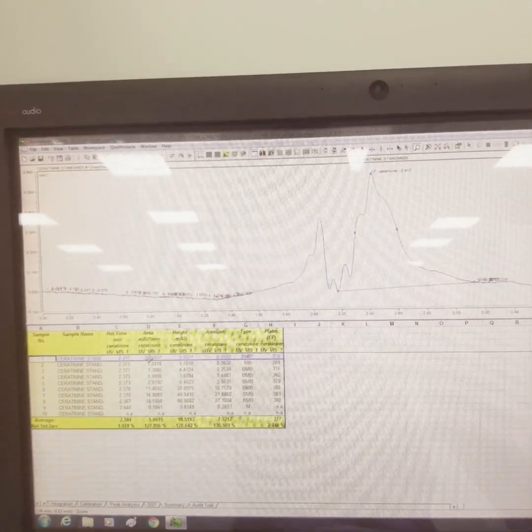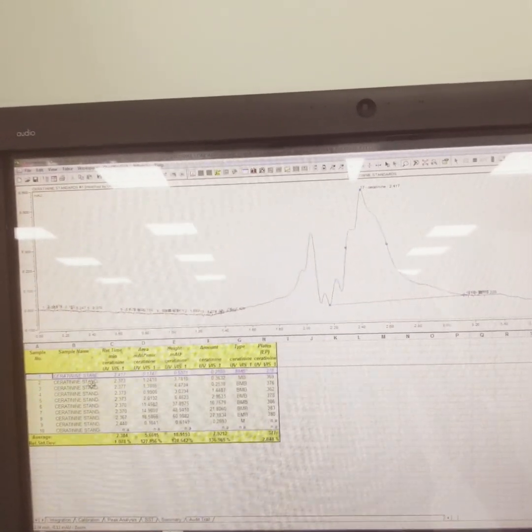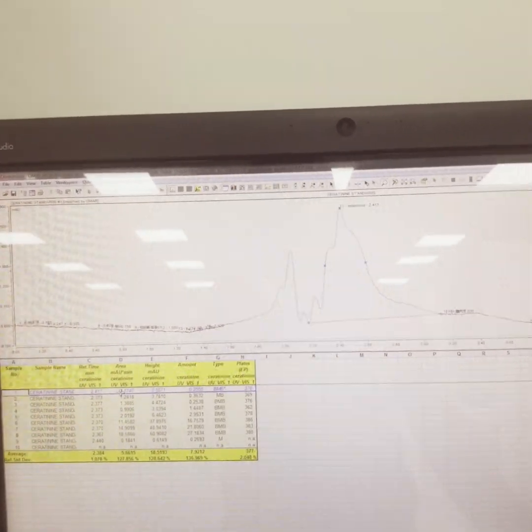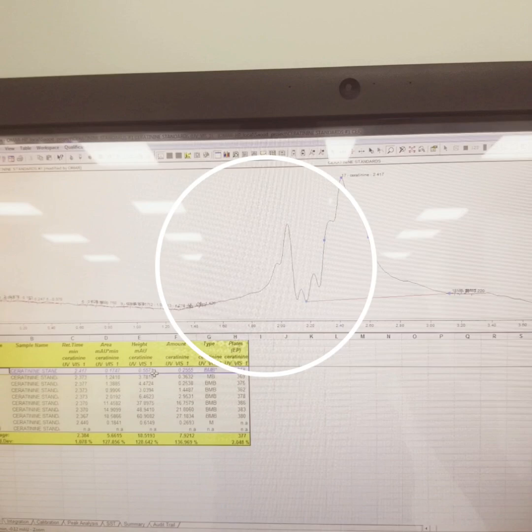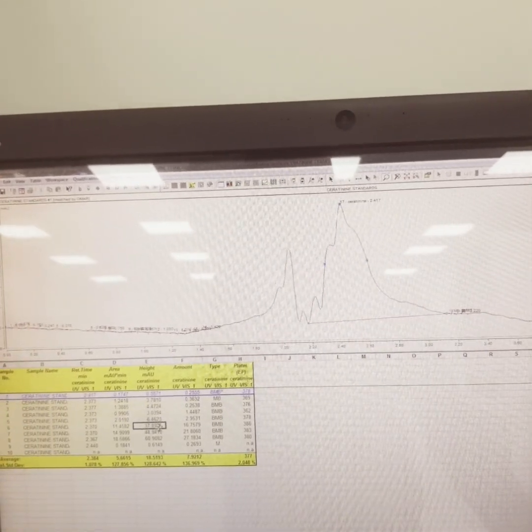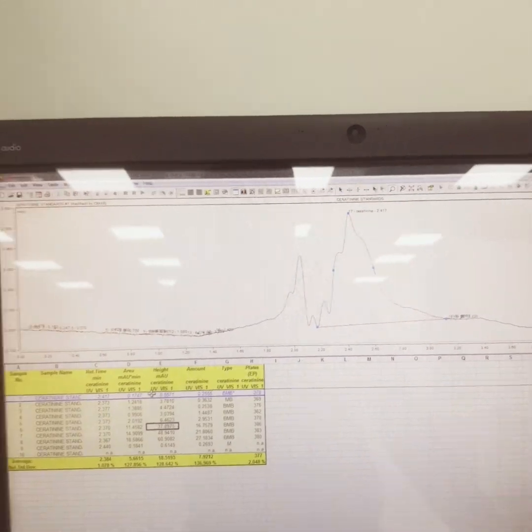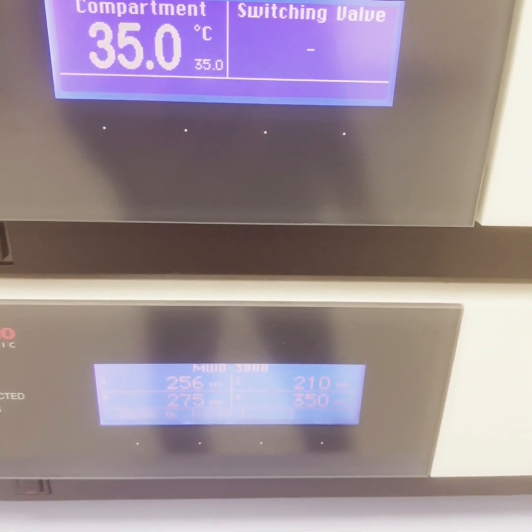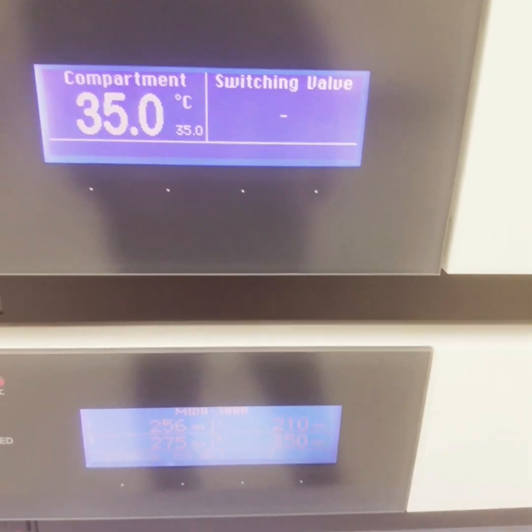And the minimum area, if you see here, if we are starting from 1, so this was 1, 5, okay, and then we have 8, 10, 20, 40, 80 and 100. So for the 1 ppm, this height is 0.5771, and this is 0.78, 0.36, 37. And actually here if you see, we have turned on the 4 UVs. Basically you can use 1 UV, I mean data points, or 2 or 3.